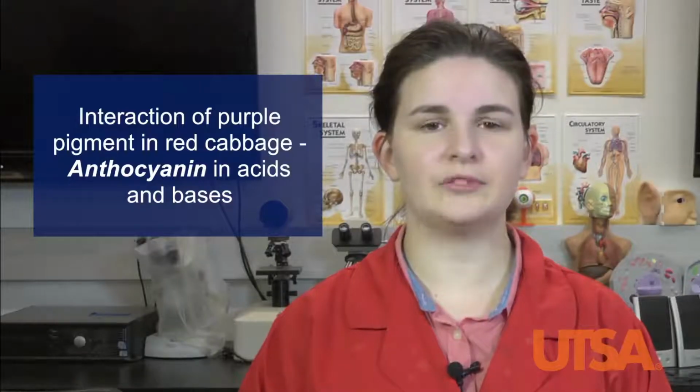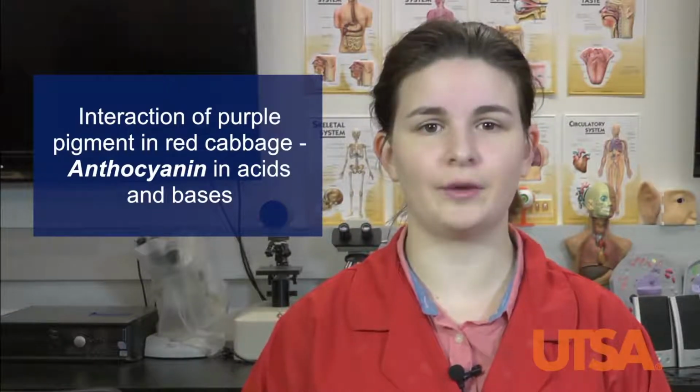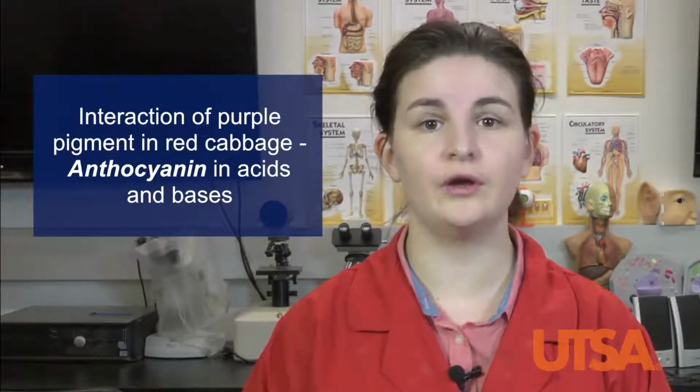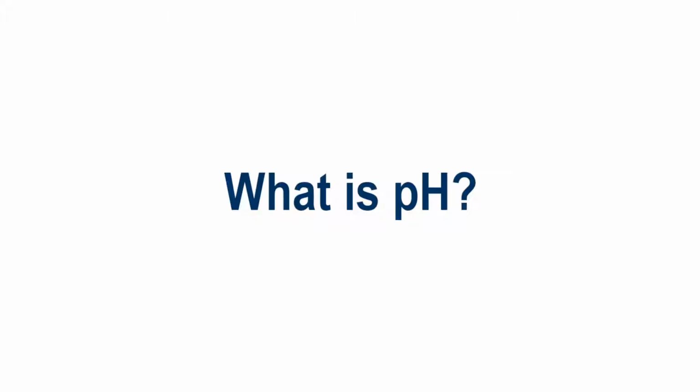The reaction we'll be observing in this demonstration is the interaction between a naturally occurring purple pigment in red cabbage called anthocyanin in the presence of acids and bases.